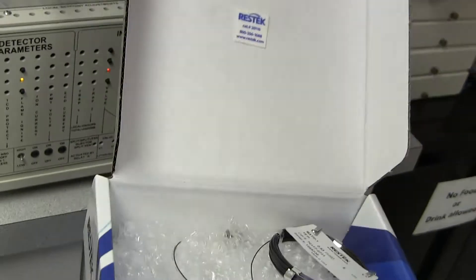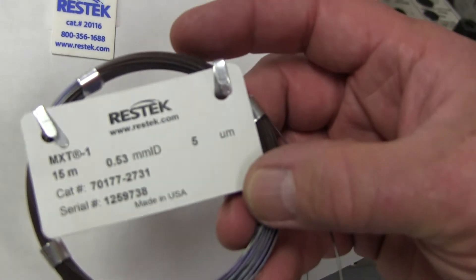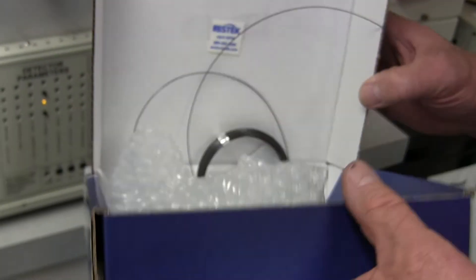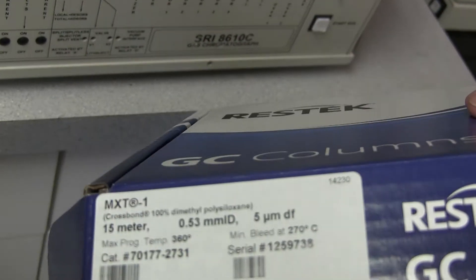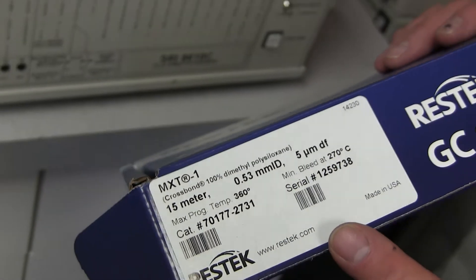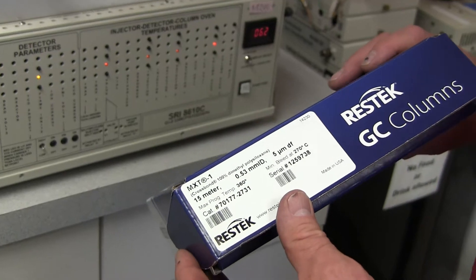Unfortunately, they don't always put the maximum temperatures on the tag on the column. There's no mention of the maximum temperature on the tag. So you have to really note it when you open the box. The box has the maximum temperature, but the column itself doesn't say. You can always go to Restek's website and look it up and that's what you should do if you're not sure what the maximum safe temperature of the column is.